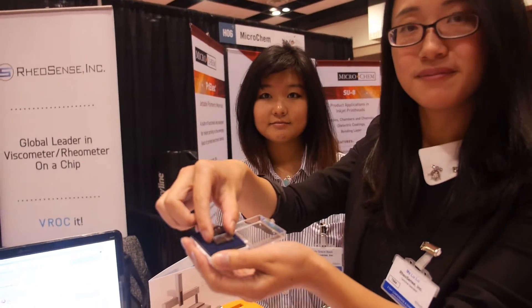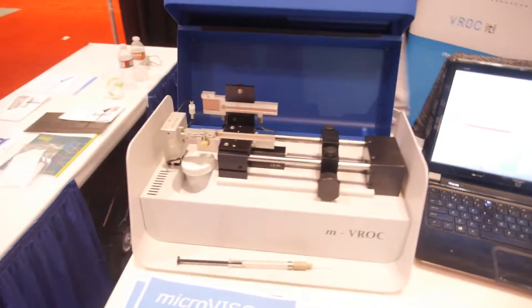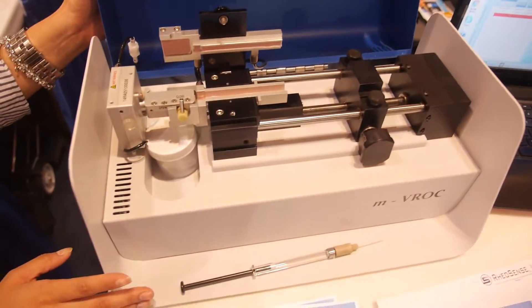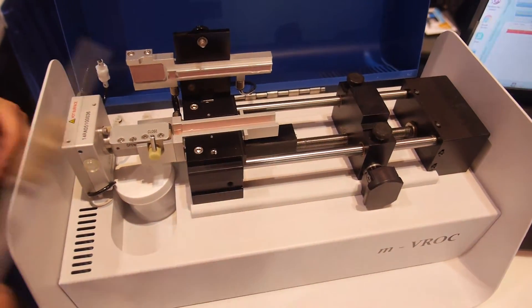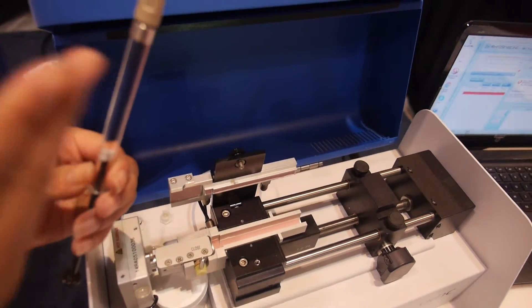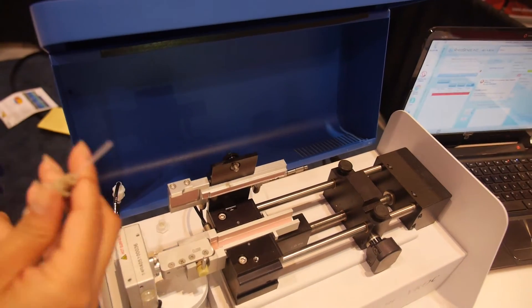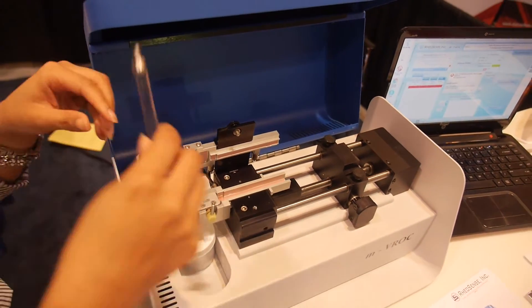So that's the chip — that's your product, and it's in this machine here. This is the m-VROC viscometer, more of a lab bench. What you do is you load your sample — we just have some water detergent solution here — and we connect it to the chip.